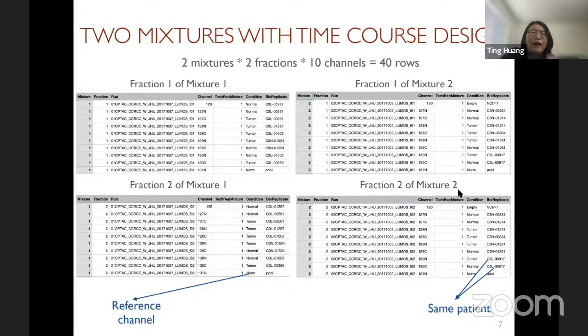We also have a question about whether special characters in the annotated sequence will cause any error. Sometimes yes, because if you use some special symbol in the annotated sequence, it will cause errors in the downstream analysis.